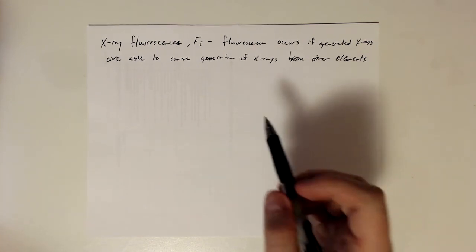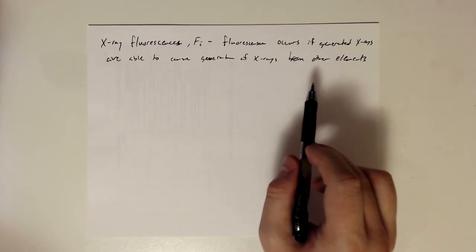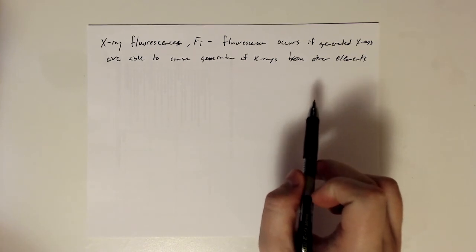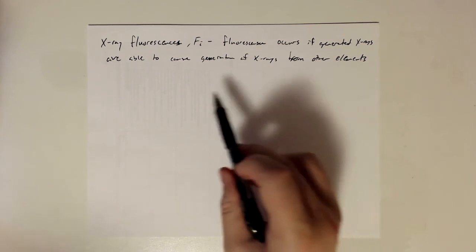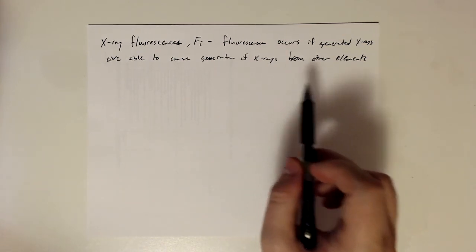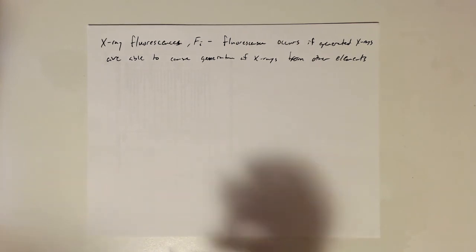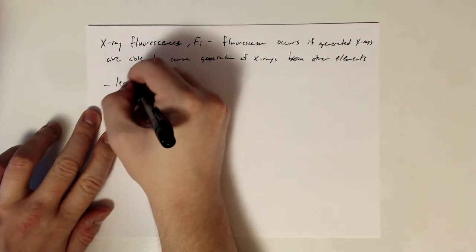And so because the generated X-rays are typically going to be lower energy than the primary beam, they are less likely to produce another X-ray because they have lower energy. So because we're lessening the energy, there's less of a probability that it's going to do that. So it's really, of the three factors, the least important.